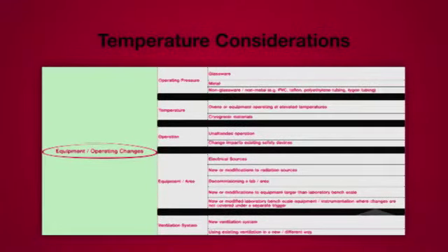Consider the chances of personal contact. Is there potential for burns? Labeling, protective shielding, and heat-resistant gloves may be needed. And what about an oven overheating? Could this cause unwanted degradation, exceed flash point, or evaporate solvent? If there are negative consequences to an overheated oven, use a secondary high-temperature shutoff.